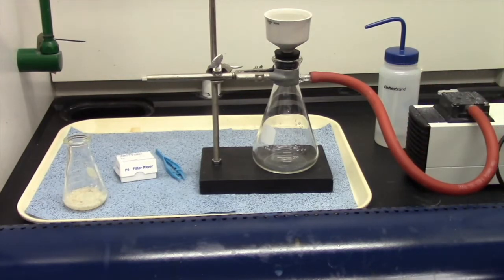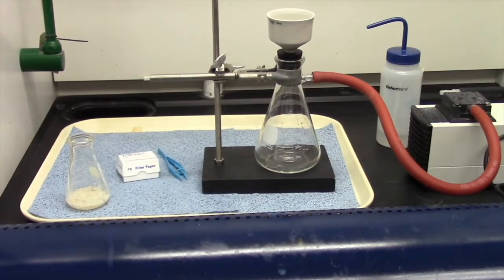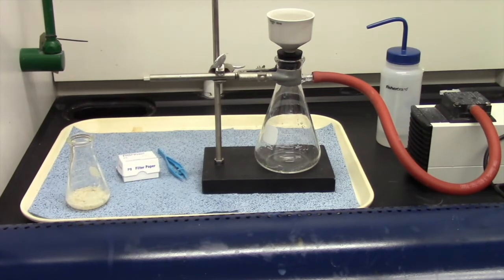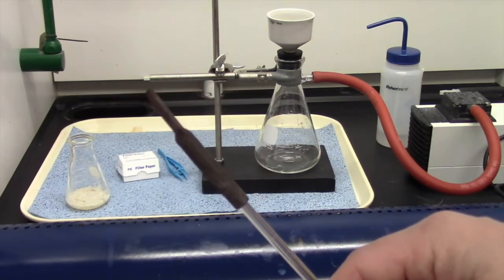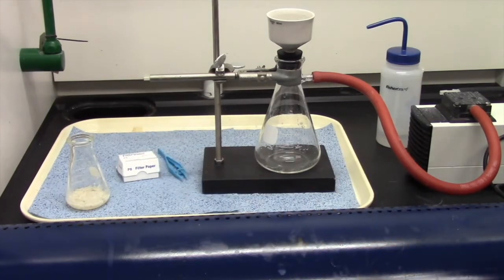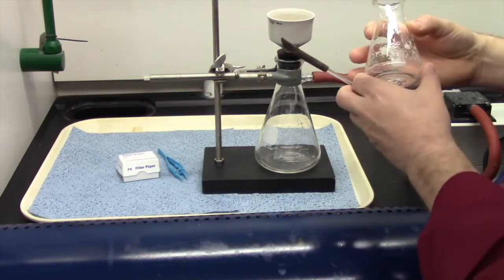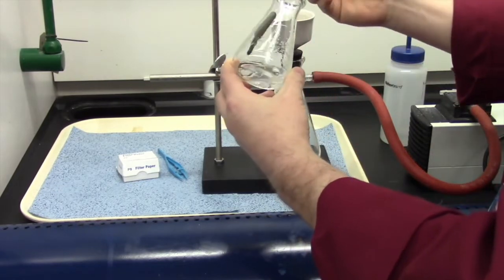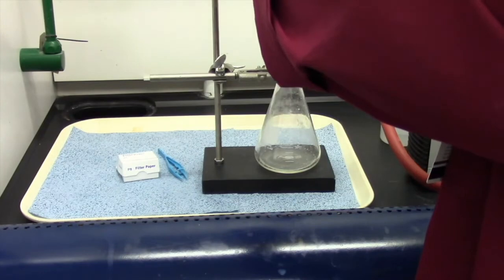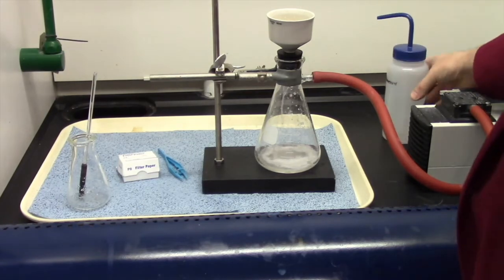Helps to plug these things in. Electricity — what a novel idea. Now we are pulling air down through the funnel, and I'm going to pour on my sample. I got myself what's called a rubber policeman — it's used to scrape out the soap particles into the funnel. I'm going to rinse with a little bit of water and use my rubber policeman to get in there and scrape off the sides a little bit. Pour it into there and set that to the side.